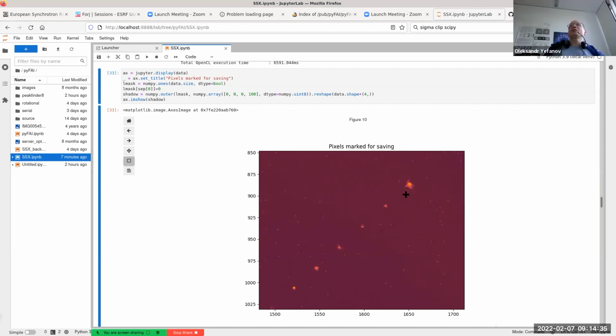It would be really interesting to see the whole pipeline. How many images per second can you do with these corrections? Well, all together, that's something we will start working on soon, because we didn't have it yet. Everything is assembled only for less than 1 week now, and I got the feedback from the guys who are doing the integration that it's working. Very positive feedback from them. Honestly, I expected to have more trouble, but I don't know yet the figures that we obtained.